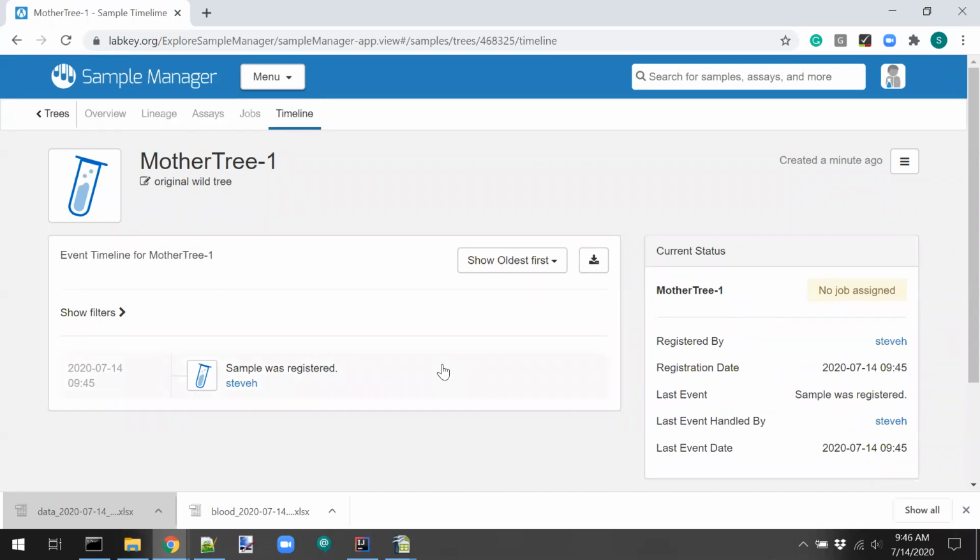And I hope there's enough time to get your questions. Anything, Jason, I should touch on before I hand it back to you? There is just one. Is it possible to, from within the UI, order samples for a particular study or a particular use case within the lab?